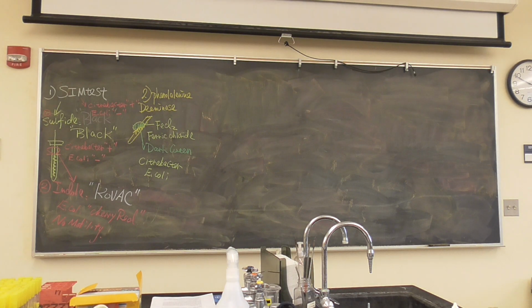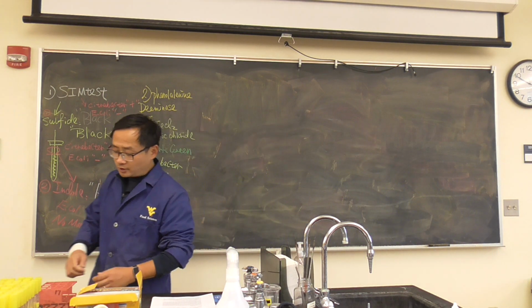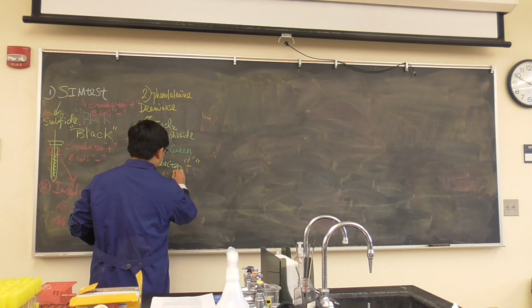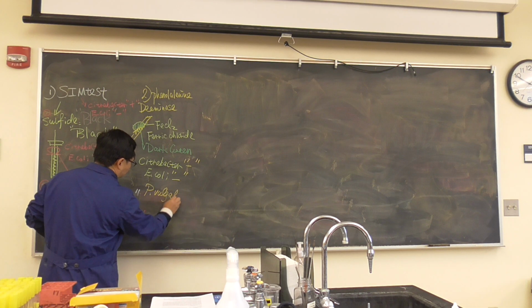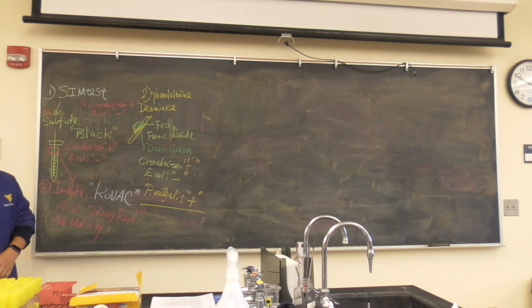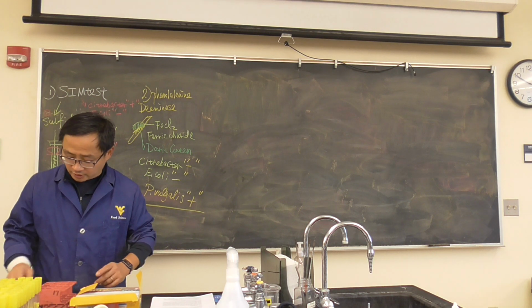It could be Citrobacter contaminated with E. coli, or Citrobacter is not a Citrobacter, or it could be the reagent is being old. Okay, so what we get here is negative. That's fine. We accept our results, but I'll tell you, Proteus vulgaris, a soil pathogen, is positive. That's theoretical. And you can do it. Maybe trying a different reagent, we'll see what it looks like.